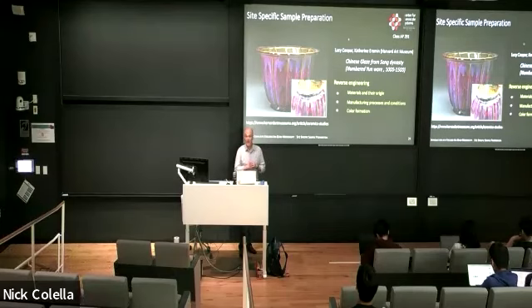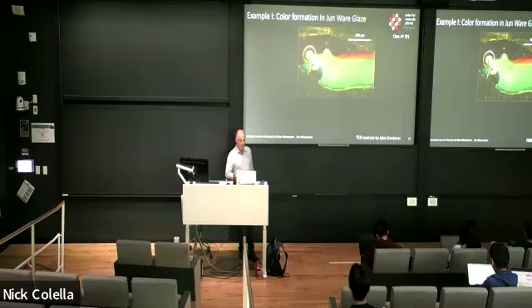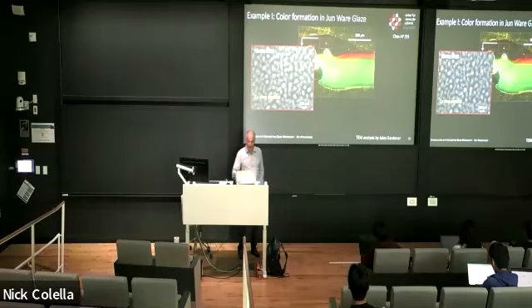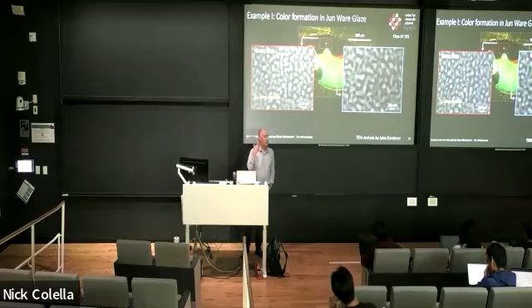They have vases from the Song Dynasty, and they were interested in the particular properties of these beautiful glazes that these vases showed. And so we did some sort of reverse engineering, if you want. So we got a few chips from those, and they had very particular colors, right? They were reddish and blue, and so they were interested in what actually produced those colors. So we were able to prepare TEM samples from these specific regions and use the whole tool arsenal that we have available in the transmission electron microscope to analyze the material.